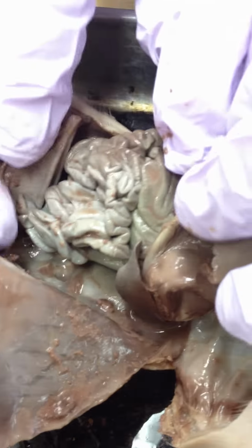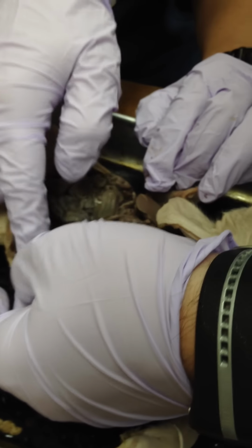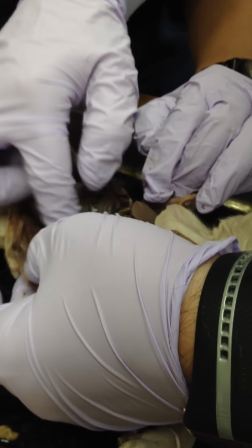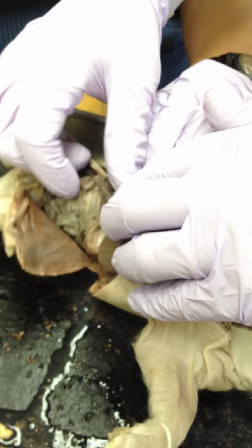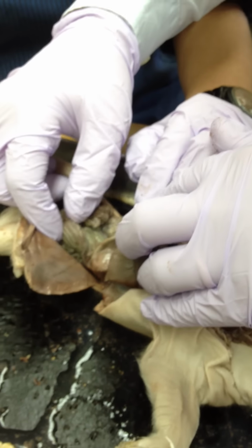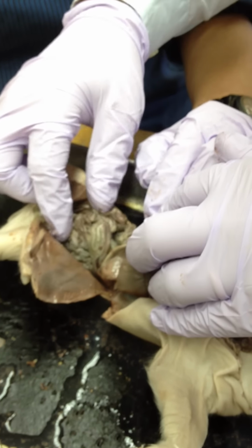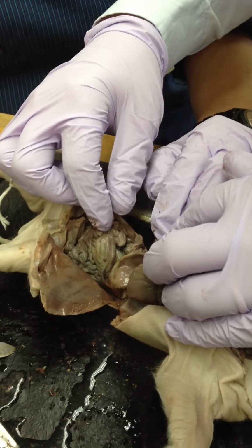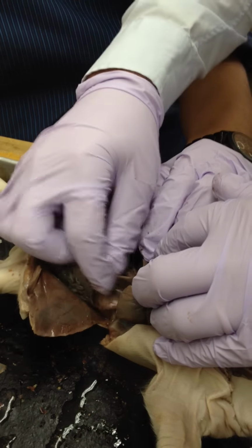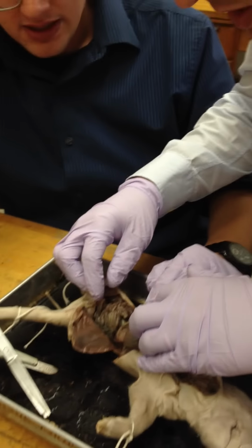Wait a second. So you want to make sure that you point out the peritoneal layer, in other words, the membrane, the serosa membranes, and tell them that all of the digestive organs, especially the intestines, the small and the large, and the stomach, are covered with a visceral peritoneal layer around it, right, with the mesentery.